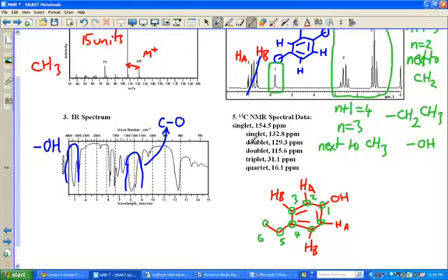Now usually in the carbon NMR spectrum, when you have peaks appearing between about 120-ish and 150, those are indicative of benzene ring carbons. And they're usually present in sets of 4 or less, depending on what the substitution pattern on the ring is. There's also 2 more carbon signals for these 2.